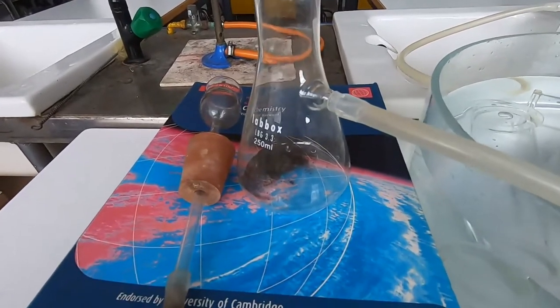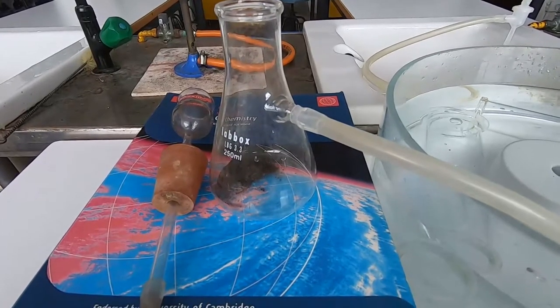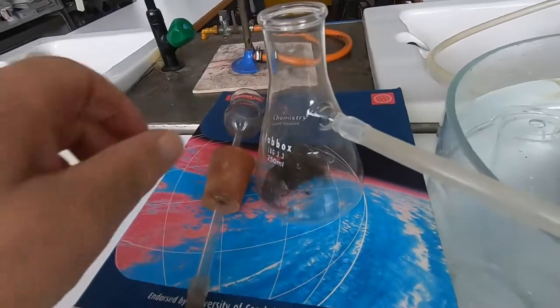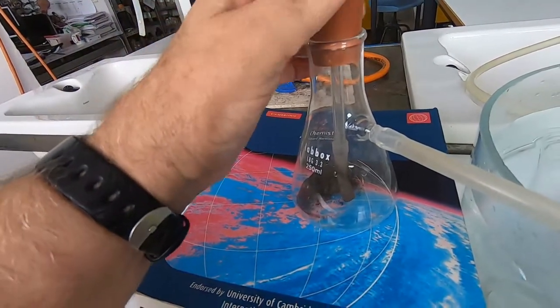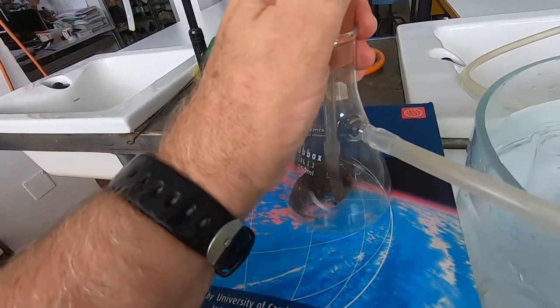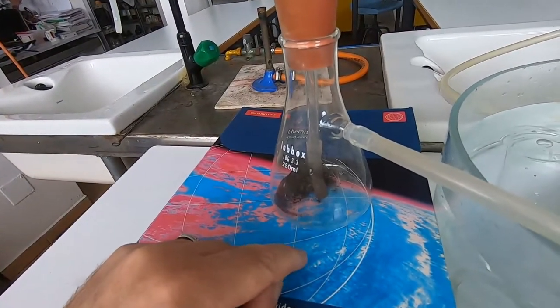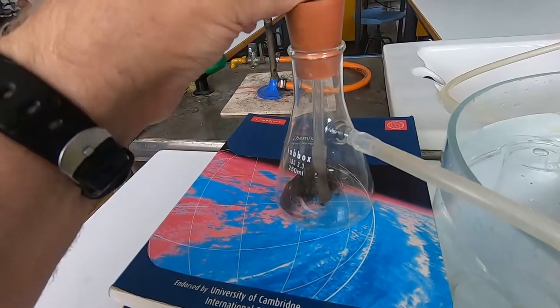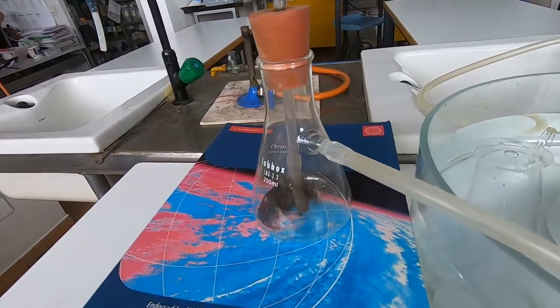I've now placed some manganese(IV) oxide in the conical flask, and I'll just replace the thistle funnel. You can see I've got a little extension on the thistle funnel because I need it to go down right to the bottom, so that the oxygen that's being produced doesn't escape through the thistle funnel — I need it all to go down the sidearm so I can collect it.